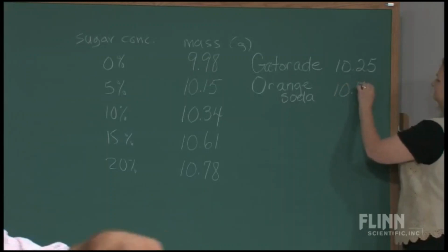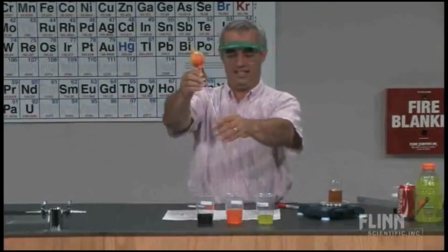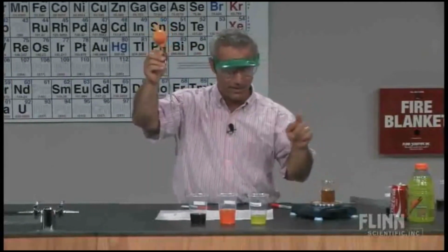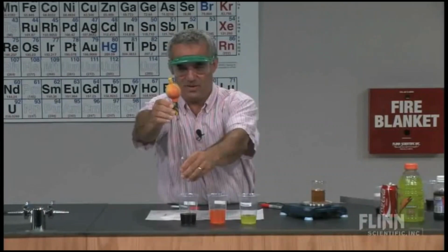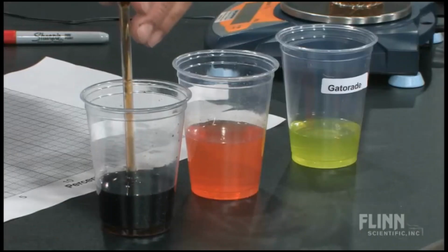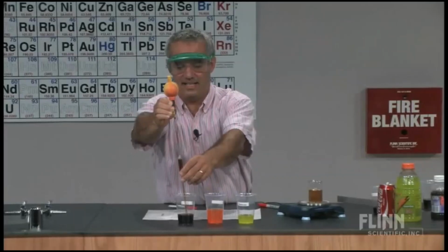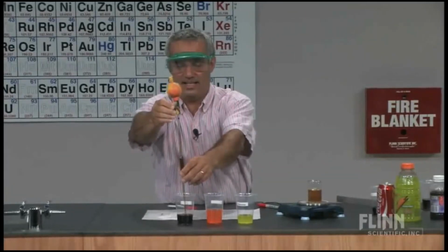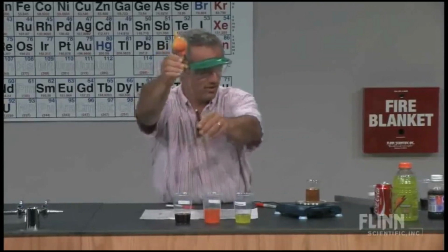What's your thinking? Coke. More or less sugar content than the orange soda? Let's find out. Zero it. Bring that Coke up. Whoops, wrong one. Okay, there's your Coke.